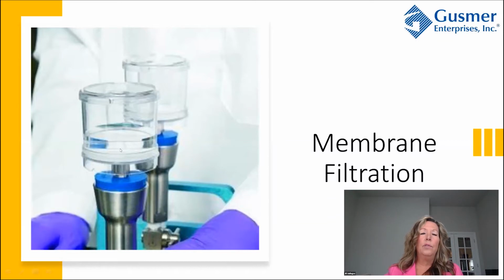And then at which time, with one of the other funnels, you can use a sterilized tweezer to remove the membrane and place it on the media. Or in this case, you can just add the liquid media and then incubate.